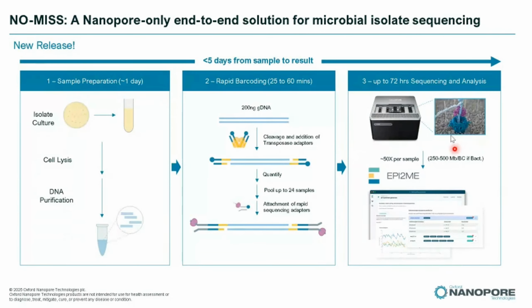For the sequencing, that can take up to 3 days, but a lot of times 1 or 2 days is enough to generate enough data, more than 50x coverage for the bacteria. Nanopore also offers analysis software as a free offering, with no additional charge, which helps to assemble the data generated from the sequencer.